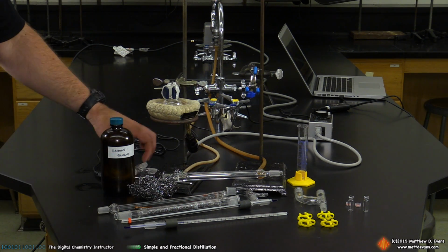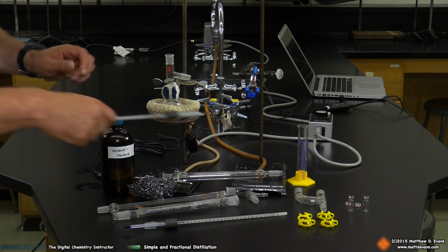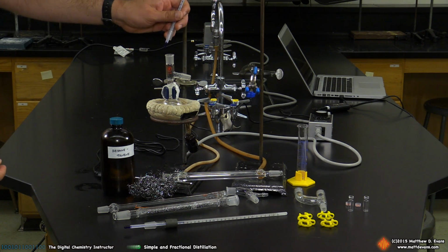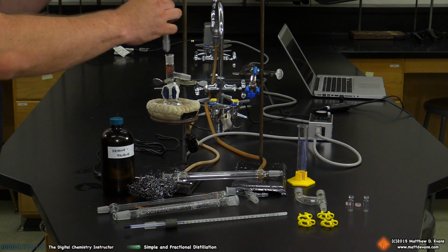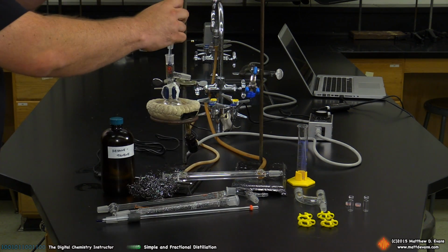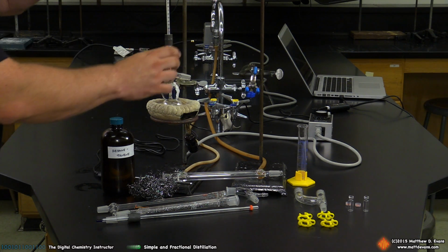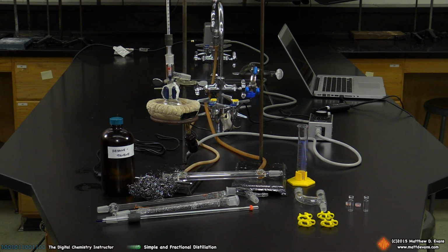So simple distillation, I've already shown you parts of that. We've got the three-way adapter. I've already positioned the thermometer properly for this setup. I think this is the one. Let me check this. Nope, that's definitely the wrong one. So it's this one. Okay, I'm going to orient the thermometer so I can easily see the data. All right, so that's that.